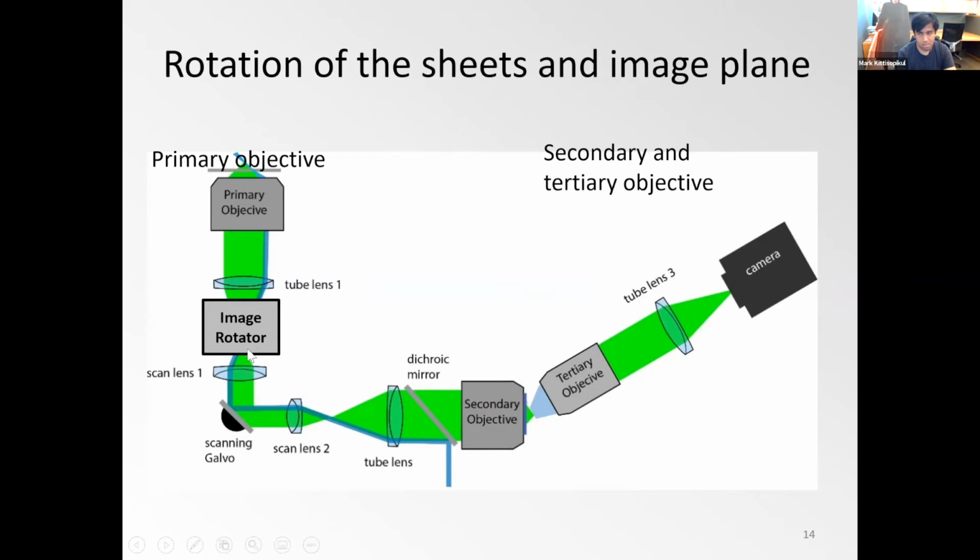So it has then again the same orientation as before and is mapped on the camera. In a sense, you can imagine a similar operation as the galvo. The galvo, at least in the SCAPE or in the SOPI by Manish Kumar, is the ingenious invention for OPM, or SCAPE or SOPI as they're called, to essentially scan the excitation light and descan the fluorescence.